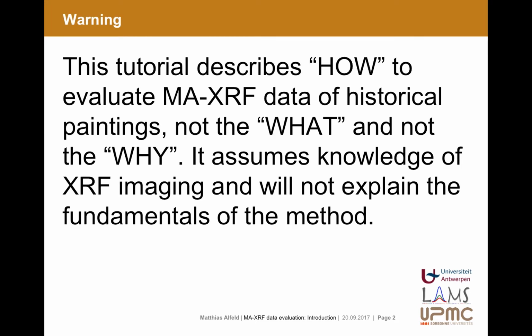Now, as a warning, this is basically an online form of the tutorial I'm giving at the International Conference on X-ray Optics and Microscopy 2017 in Trieste. So this tutorial will describe how to evaluate MA-XRF data, and not what we do and not why we do it. I assume knowledge of XRF imaging and will not explain the fundamentals of the method, mainly because in the workshop I have 3 speakers before me that will do that.